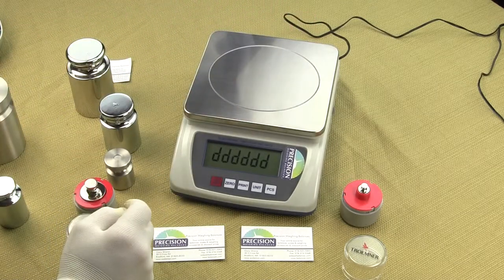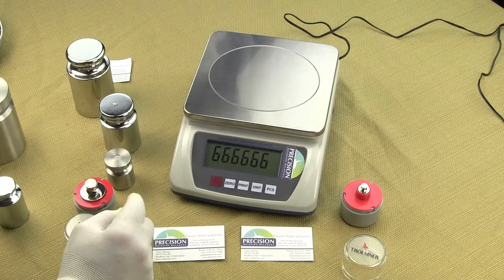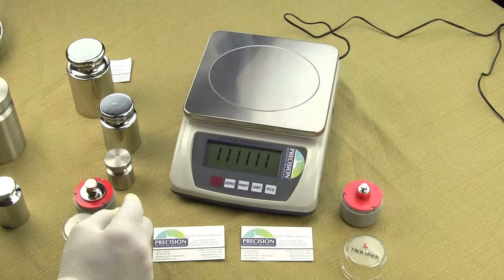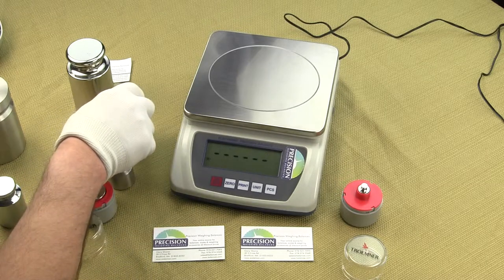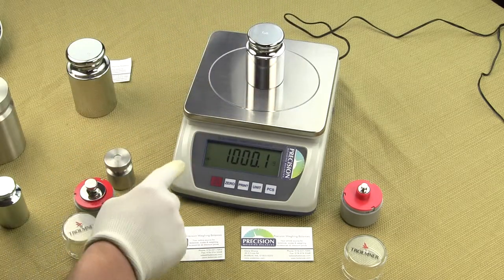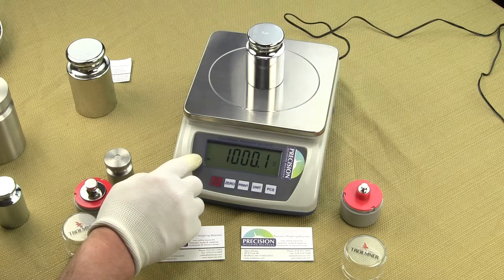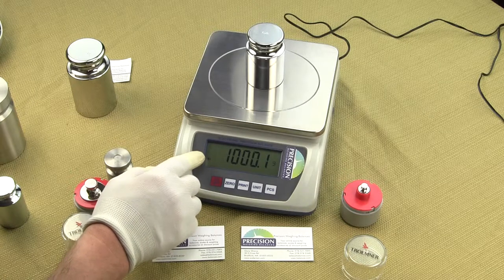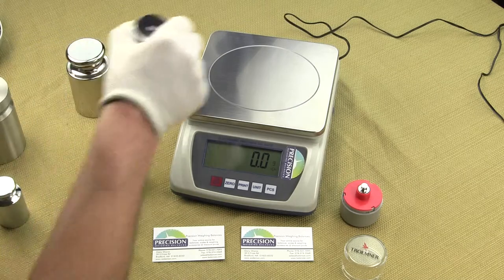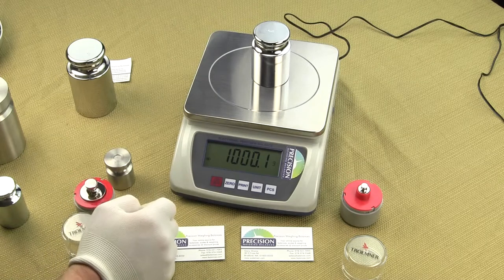When you turn on the scale, it does a power-up sequence, and once powered up you'll see it counting down as it tests functionality. It will go to zero. You can place a calibration weight on the scale, and in the lower left-hand corner there's an eye symbol indicating stabilization. A valid reading is confirmed once you see that stabilization light illuminate.